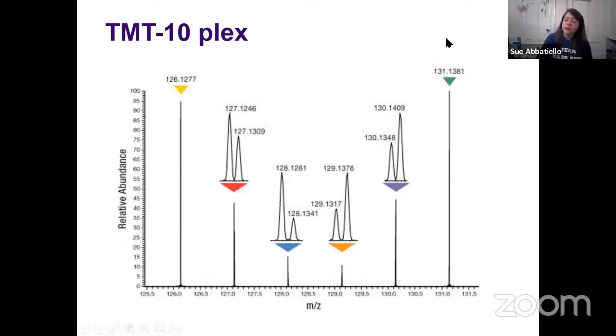Yeah, so one of the major ones is exactly that. When you look at a TMT experiment versus a label-free experiment, a TMT 10-plex allows you to look at 9 samples plus a control simultaneously in one run. You would probably want to analyze that in triplicate. Versus if you were to do those same 9 samples plus control in label-free, you would need to do each one of those runs in triplicate in order to get the technical variability of those measurements. And so there is a balance.